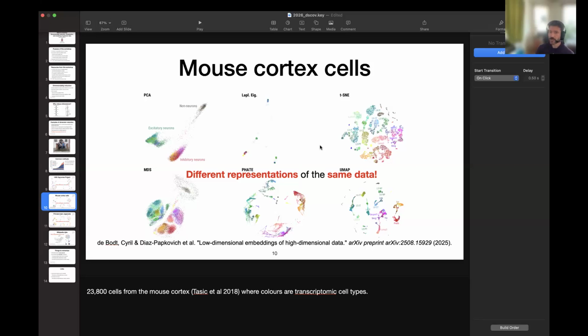So with a method like UMAP or t-SNE or PCA, you can just run the method that you want, create a visualization that you find convenient for the properties that you're trying to preserve, and then color it in by the label that you have, by some gene expression. That'll give you a more intuitive idea that's more data driven, as opposed to just looking at it and trying to figure out, I think this cell looks like this other one. Maybe they're the same cell type.